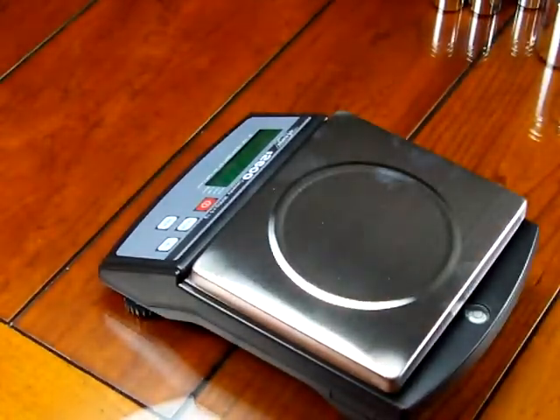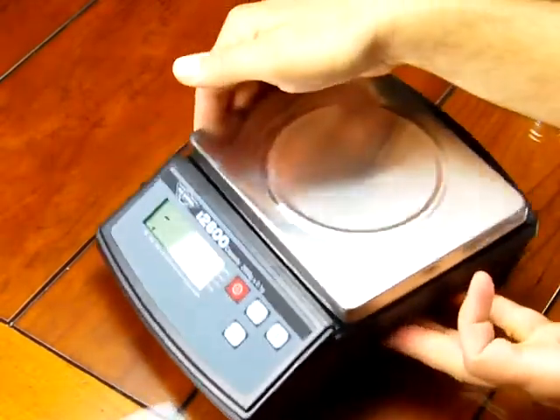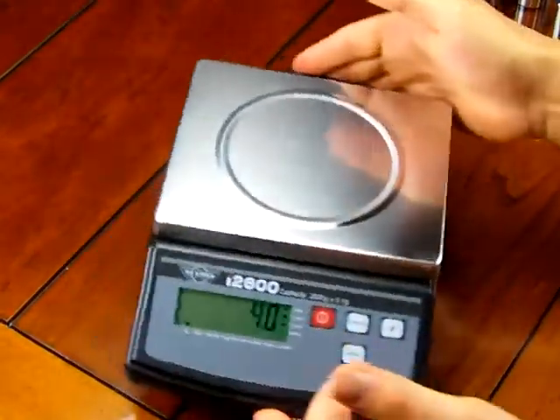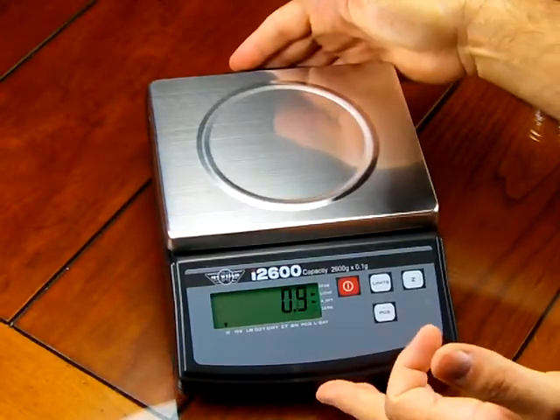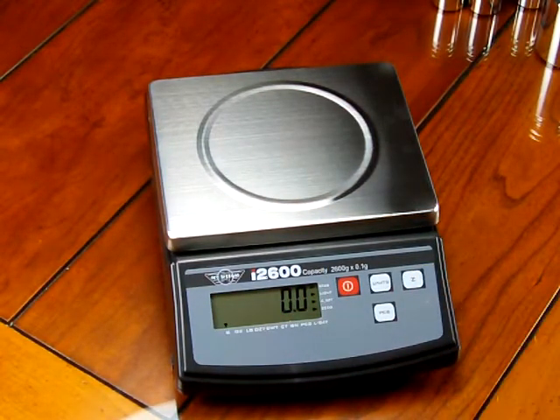So those are the basic features of the MyWay i2600. It's a nice basic scale — it's extremely affordable, especially for schools and the educational market. It also has parts counting mode if you want to use that feature. Simple, basic, affordable — that would be the best way to describe the MyWay i2600.